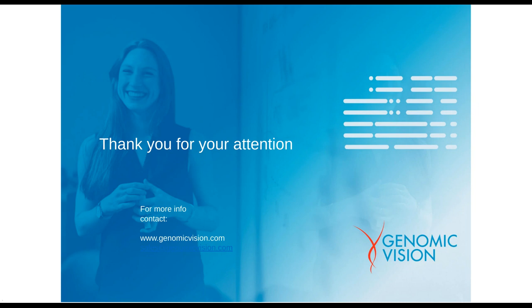Yeah, that's a good question. This is a really new method, as you mentioned, and we are improving our technology and always changing our software so that it becomes more automated and more precise for detection. This brings us to really high throughput, and it can be used every day in the lab.